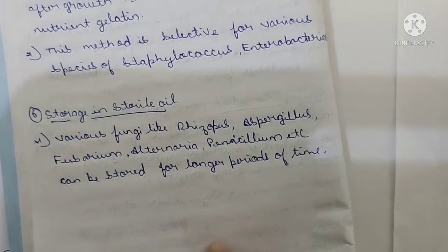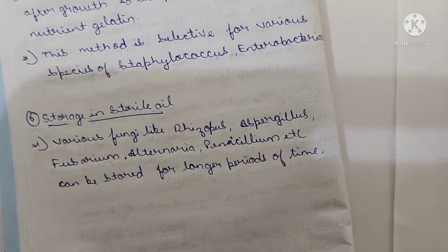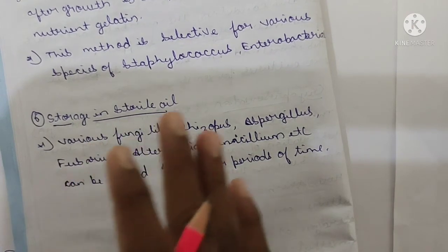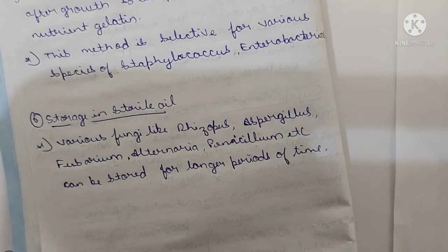Yes, my dear brothers and sisters, this is the video for you all on pure culture, how to isolate the pure culture, and preservation of your culture.